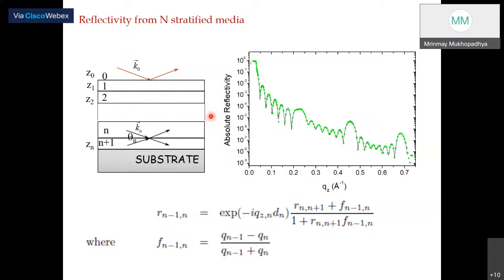That is the very unique thing about X-ray or neutron reflectivity, because you are not seeing only the surface topology or surface information, but what you would see by cutting and doing TEM.